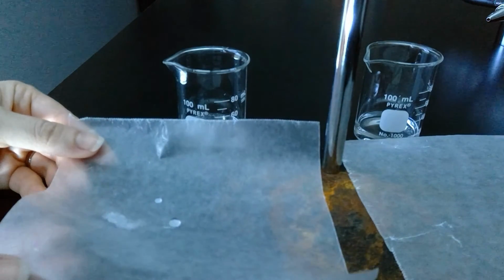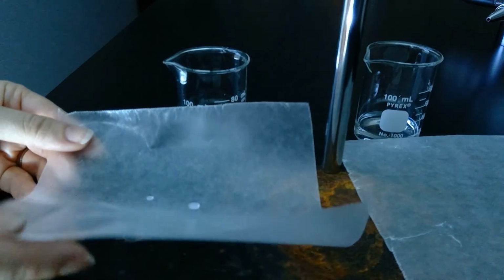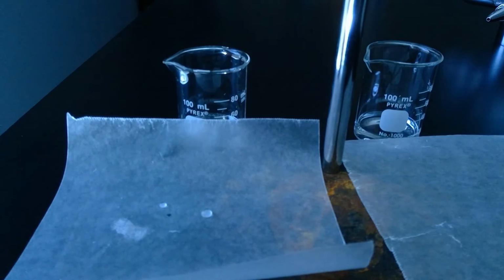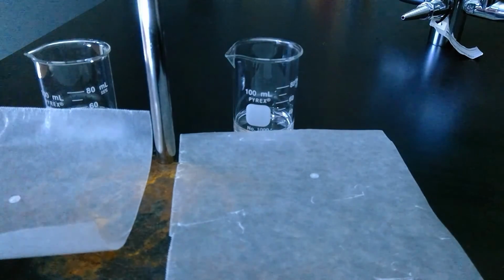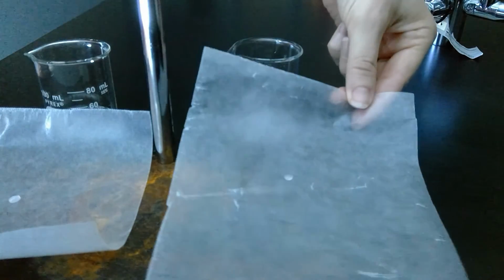I can actually move this around on the wax paper if I move the wax paper around. We're going to test the same thing for acetic acid. This also stays as a rounded drop. Still moves around quite nicely.